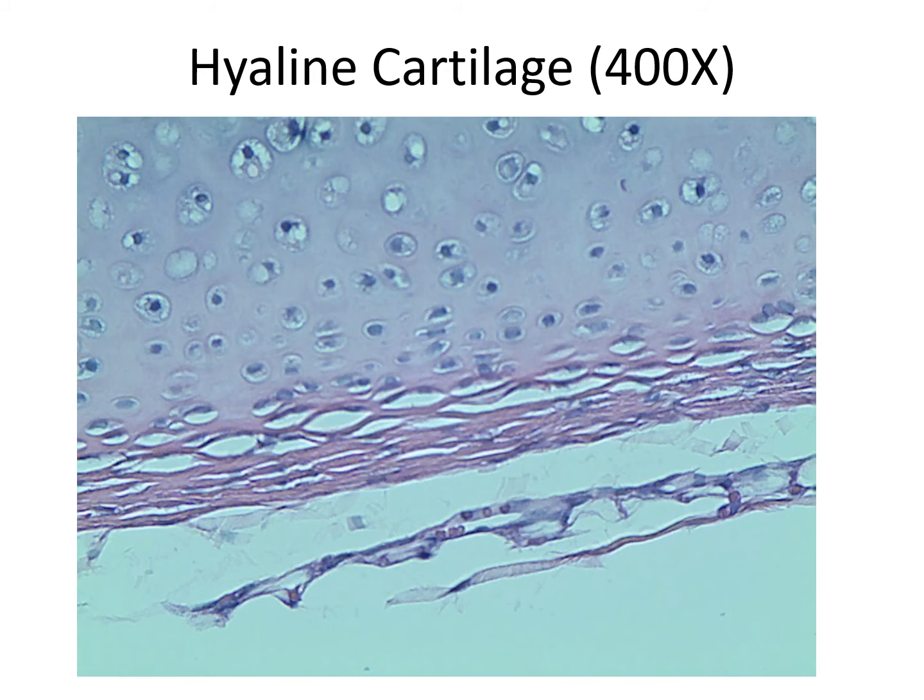This is a hyaline cartilage. And in the hyaline cartilage, you see those chondrocytes. That's a chondrocyte. That's a chondrocyte. Here's another chondrocyte. And what's surrounding these chondrocytes is this lacuna. So we have several lacunae. Here's a good lacuna, and this is a cell inside this lacuna.